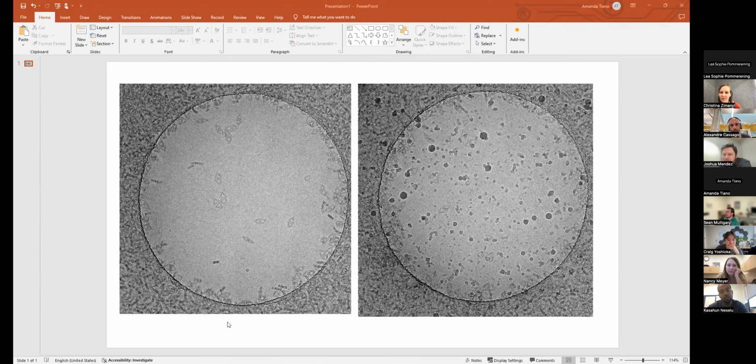Is it pumping as fast as it used to, or is it pumping slower? You mean like the IGP, like IGP-1? Yeah, when you insert it. It's a lot faster. It's really fast now that we just replaced IGP-1. Before it was slow, but I was still seeing this issue before we replaced IGP-1. Yeah, I don't think it's the O-ring then.